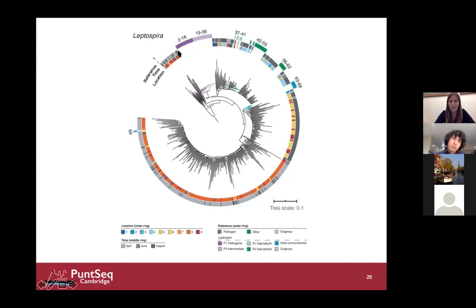You see that we have the pathogenic clade out here, but it doesn't really cluster with any of our reads. It's really its own clade. Whereas the remaining reads, like the saprophytic reads, cluster more clearly together with our reads, pointing towards the reads that we have found from Leptospira probably being only saprophytic Leptospira reads. And hopefully, we haven't proven it finally, but we suggest it's not pathogenic.